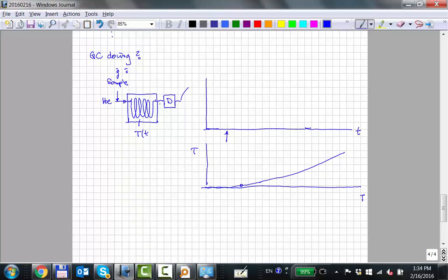And when it comes out, the detector says, gotcha. And it says, I've got this much reaction, and that's our methane. And there's a bunch of it in the separator gas, right? Had we injected the separator oil, there wouldn't be a very big area because there's not much methane left in the oil.